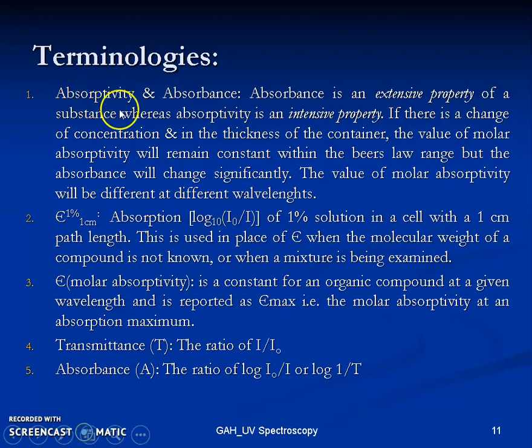Okay, so absorptivity, as I said, is an intensive property, whereas the absorbance changes with the concentration. That is what this means. The value of molar absorptivity will be different at different wavelengths. This is also a very important thing which we should remember. So molar absorptivity will be the same for different concentrations, but it will not be the same for different wavelengths.